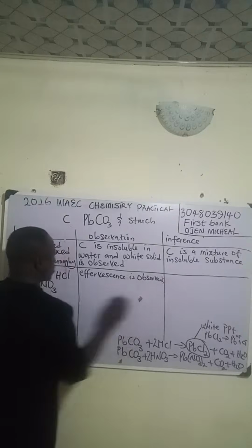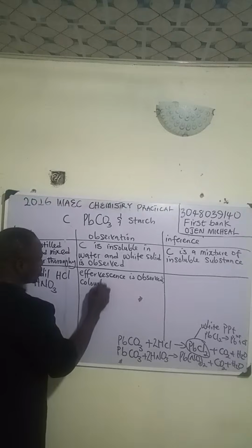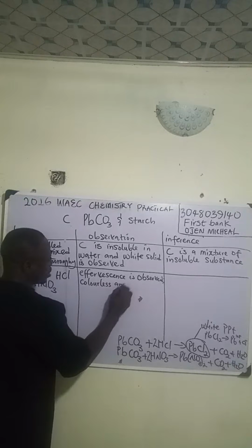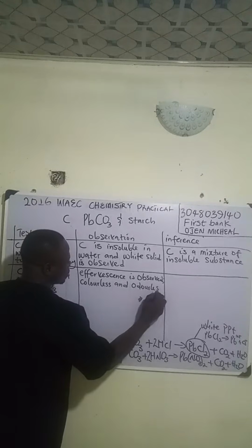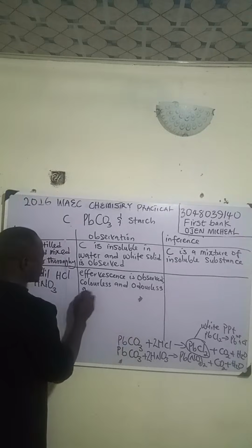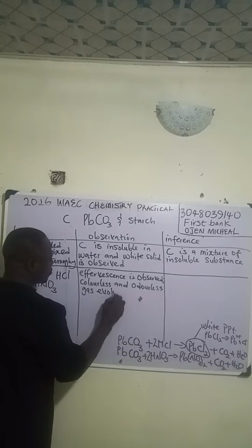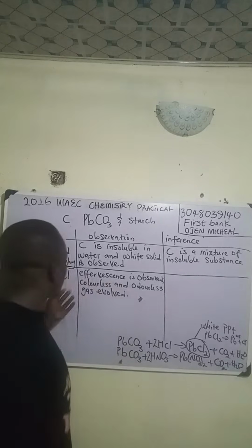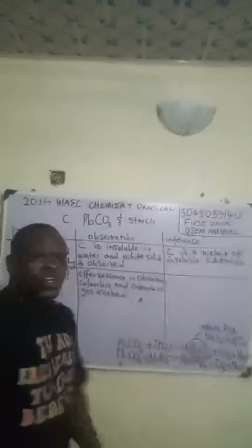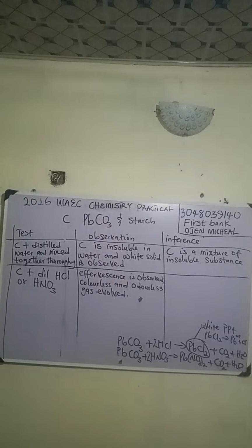Colorless and odorless gas evolved. That is what you are going to see if you treat this one. But with this HCl, it will be partially white. With HCl, it will be a little bit white. But that is what you are going to report.